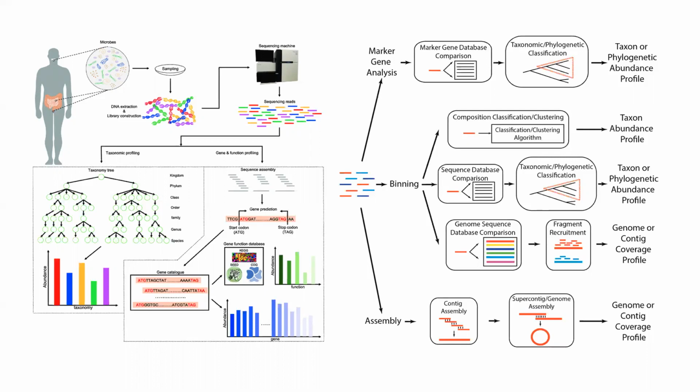And when you look at those sequences of DNA, one of the challenges is mapping them, because we're talking about shotgun sequencing, so we're talking about short reads. And when we look at these short reads, it is challenging to combine them into longer sequences and understand how they actually map to a reference genome. But it could be done. So if we do that, we are going to, one, lose some of the low abundant portion of our data. Two, we might not have a good reference. And three, we might actually expect a lot of noise.